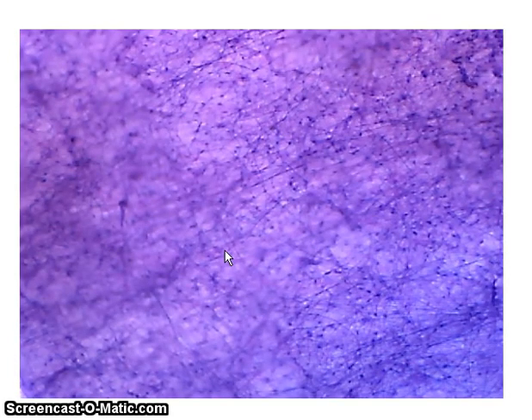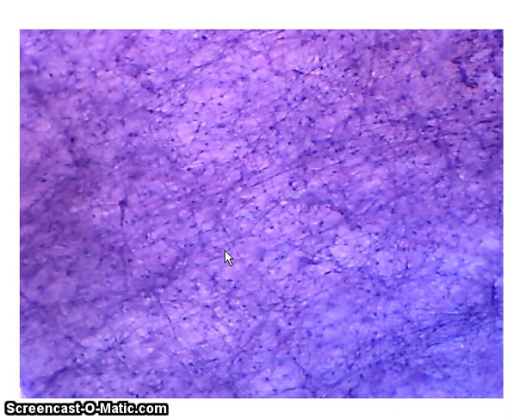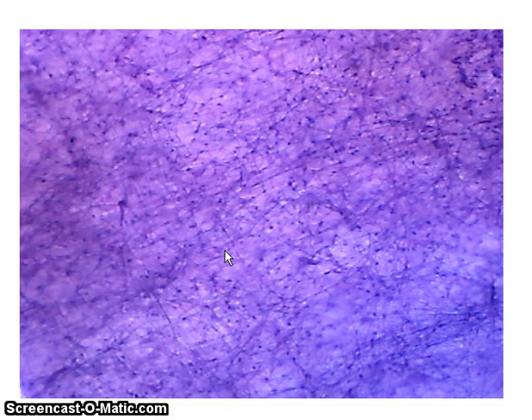Here I am at 100, and you can see right off the bat there's a lot of stuff going on with this tissue type. And so I'm going to have to go up again in power to be able to see very much. So here we go up to 400x. Here we are at 400x, and if I tweak my fine adjustment back and forth, you can see how certain structures come into focus and go out of focus.